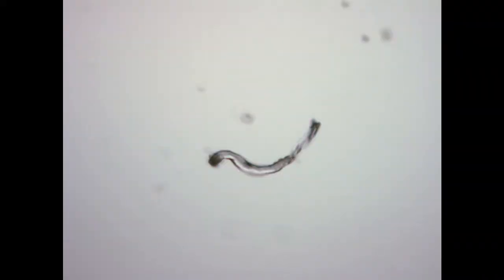I think these were from toilet paper, and that's what's so great about toilet paper: we can put that down our toilets because it disintegrates quite easily in water. But we also picked up some other types of fibres that looked quite different. We picked up fibres that were red or blue in colour, which would suggest that they've been altered in some way by humans, whether through dye. We also picked up some fine, opaque black fibres, and some translucent fibres that looked very different from the toilet paper fibres.